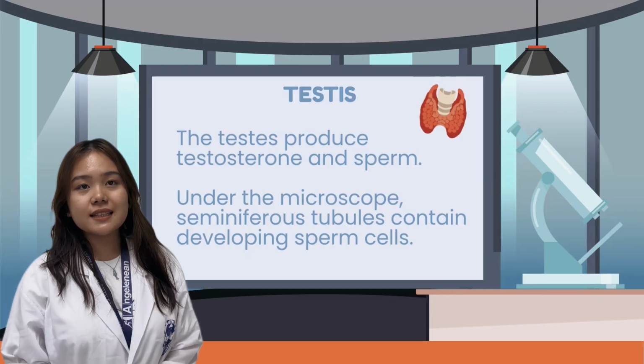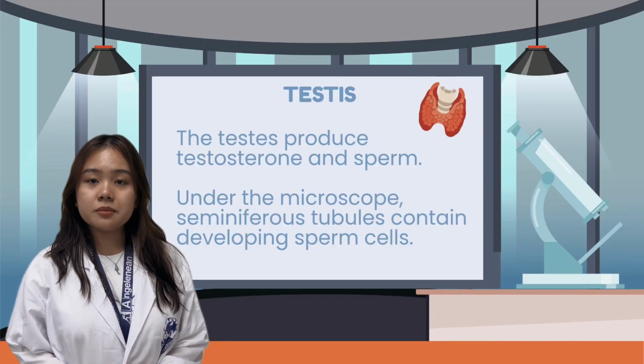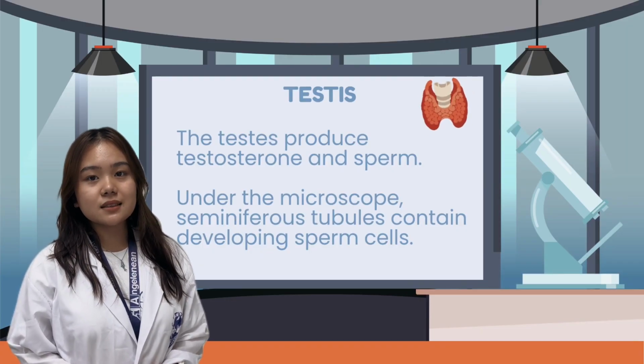Finally, we end with the testes. The testes produce testosterone and sperm. Under the microscope, seminiferous tubules contain developing sperm cells.